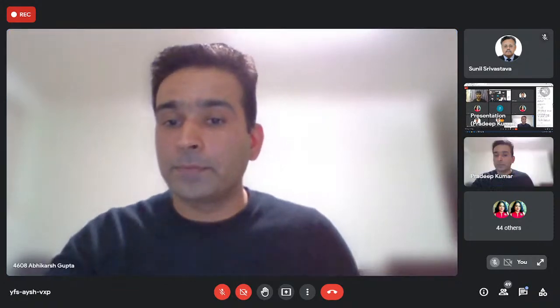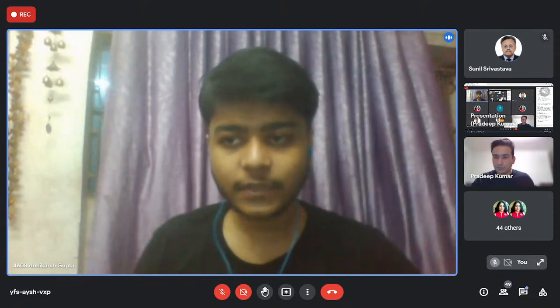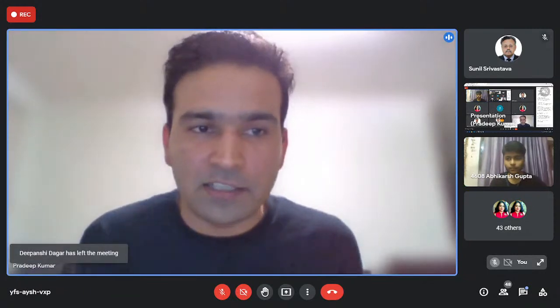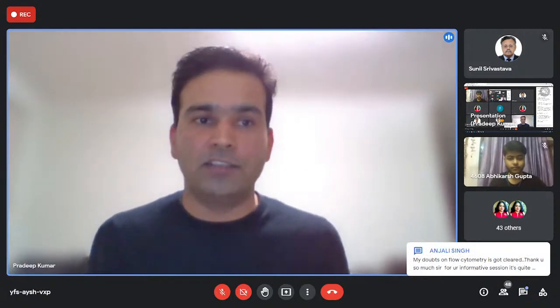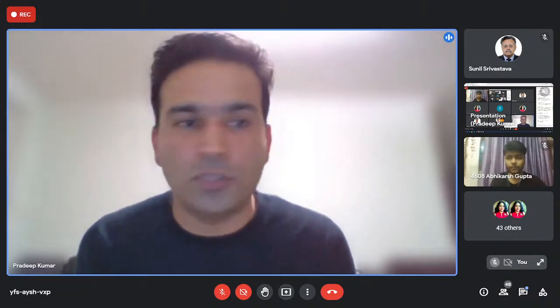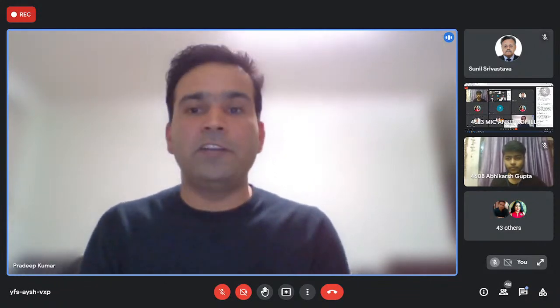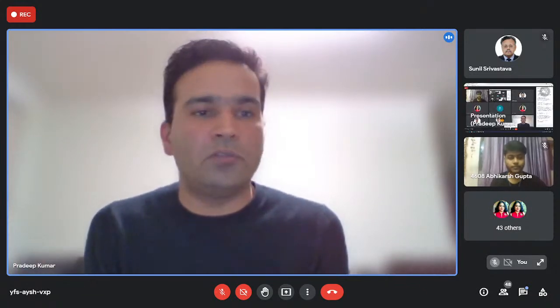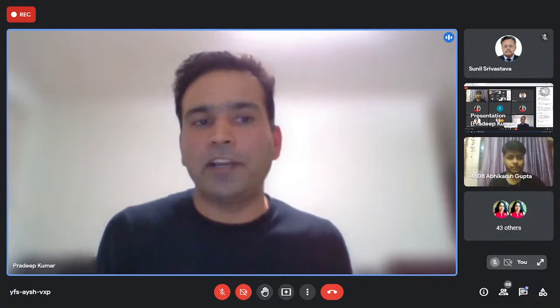Thank you, sir. The next question is by Chitrali Roy. Is there antibody specificity for forward scatter and side scatter? No. For forward scatter and side scatter, you don't need any antibody because that information comes directly from your cell, either from the surface or from the inside. It doesn't have anything to do with antibodies or fluorochrome molecules. You can run just the sample without any fluorochrome molecules and differentiate different types of cells by the size and granularity information, and you don't need any antibody for those. It basically comes from the blue laser, 488 nanometer.